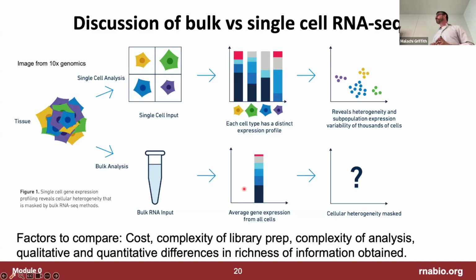When you first start working with single cell data, you might have an expectation for how detailed the transcriptional readout is, like how many reads you're getting for each of your cells. And then you start looking at the data and your expectations drop a bunch. But probably for most people, they need to drop their expectations again another order of magnitude. When you really dig into single cell data, it's amazing how sparse it is. It's really, really, really sparse. It's basically all nothingness with a few sprinkles of information. You have this massive matrix of cells and genes and counts for those genes in each cell, and the counts are just small.